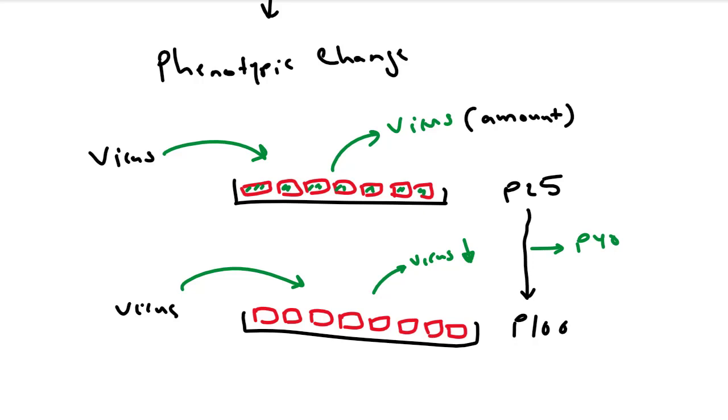So any experiment I do on cells above passage 40, I'm actually doing it in a cell population that is different from the cell population at a lower passage number. So I will make sure that I do all my experiments between passage 25 and 40. Actually, I might walk it back and just go from 25 to 38 or 35 and not even get close to 40. That way, I ensure that whatever experiment I do is repeatable.